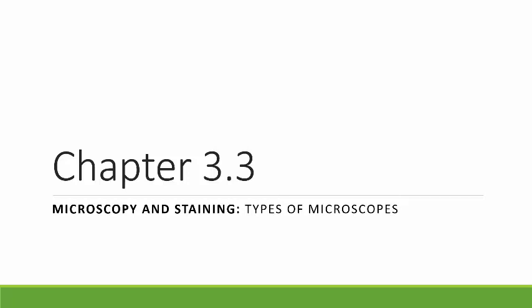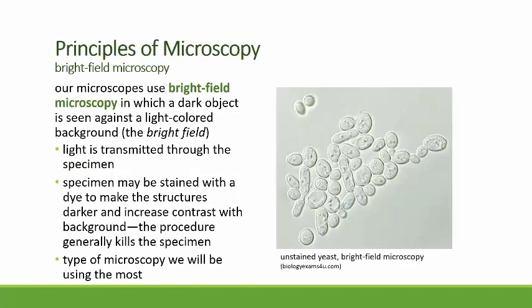In this video, we're going to take a look at some of the diversity of microscopes that are out there and the kind of microscopy that you can do with these sorts of scopes. So we'll start by looking at light microscopes. The work that we're going to be doing is referred to as bright field microscopy, most of what we'll do at least.